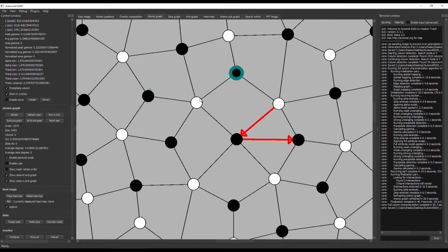Something typical that you might come across that might seem confusing when you are not so familiar. I'm going to create this situation artificially. Something like this can happen. It doesn't happen often, but it can happen. And when you start looking at this, especially if it's more complicated than this, it can be a bit hard to know where to start untangling the mess. But it is very useful to keep in mind that triangles should be avoided.